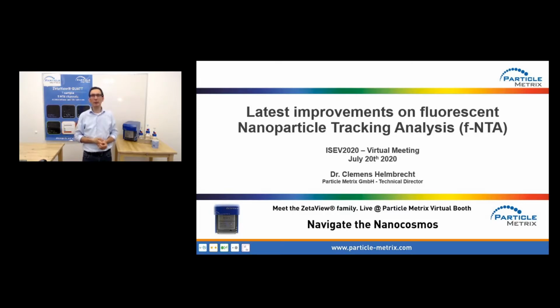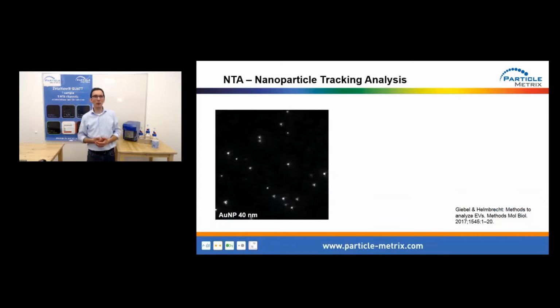I will give you a little overview about the latest things we have been doing with NTA. But let's stop a bit for some basic notions so we have everyone on board.